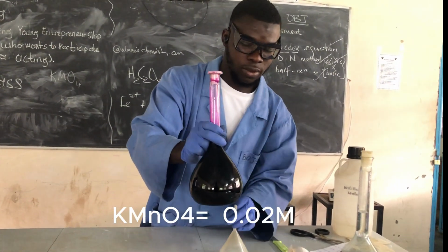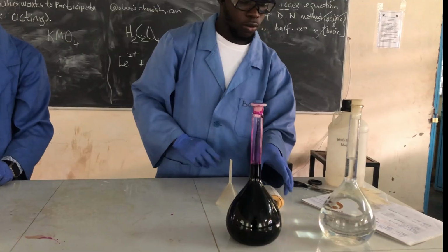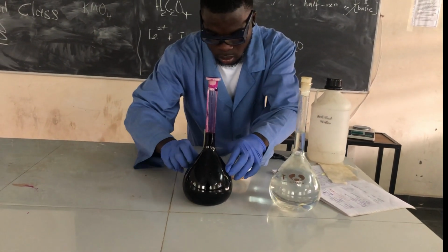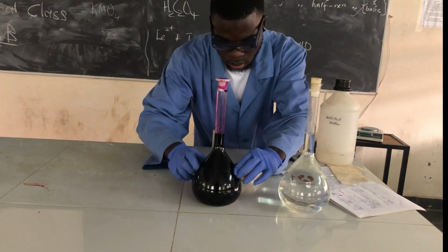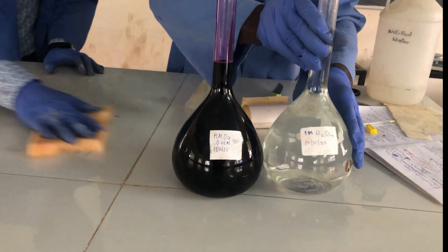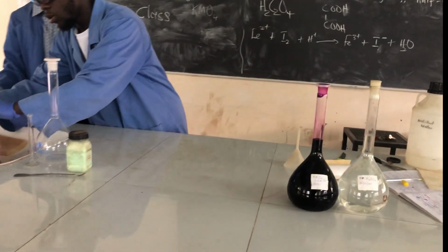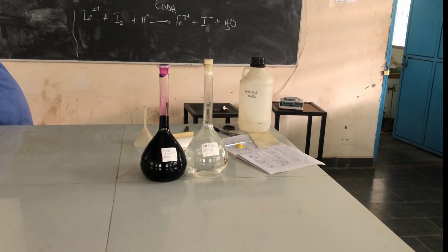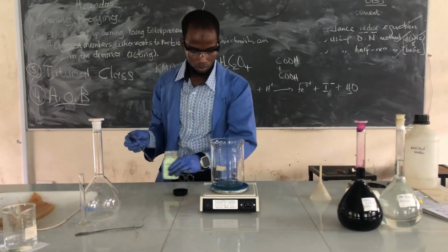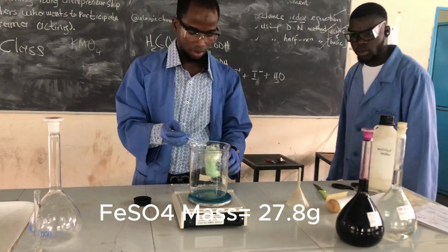So this is the KMnO4 with a concentration of 0.02 molarity. You want to start it now? So we are going to weigh about 27.8 grams.